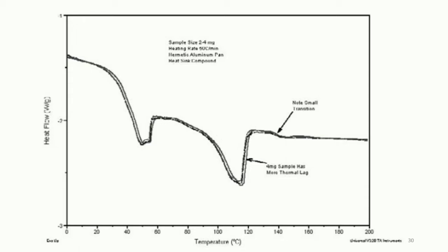To confirm reproducibility of the measurement at 50 degrees Celsius per minute heating rate, the sample may be run in triplicate, with the excellent results that are shown.